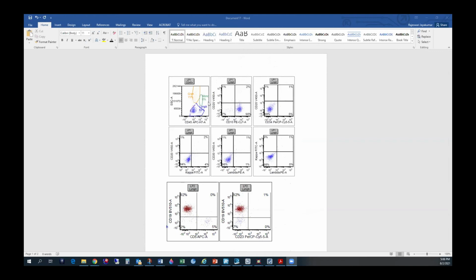There won't be a paucity of lymphocytes here, and hematogones usually lie in this area below the blast gate. You will see it starting from here and going on and merging with the lymphocyte gate. It will be like a continuous population going like that. And even in the other places like CD10, CD20 and others, there will be variable expression, a continuous kind of going from 20 to 10, but it will not be like this.